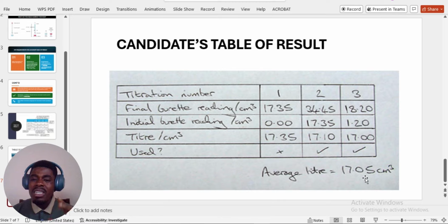And the full mark on the table is at least 5 and above. I remember 2022 was 7 marks, and so on and so forth. So it can go up to 10. But if you are focusing on the table alone to get at least 7 marks, it can do you good, rather than sitting down unconcerned thinking that someone will come and check the table for you.